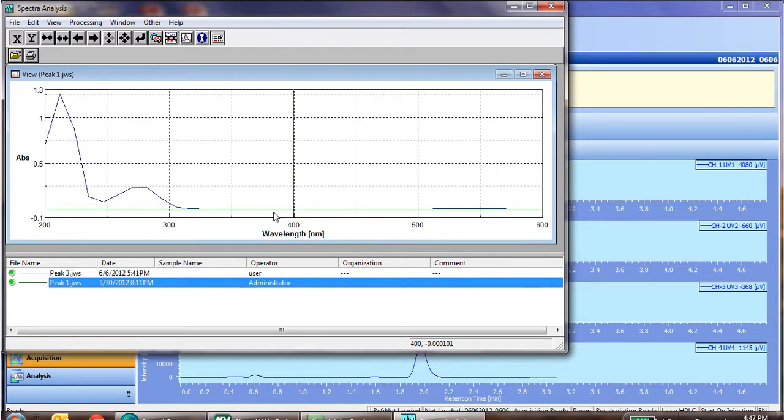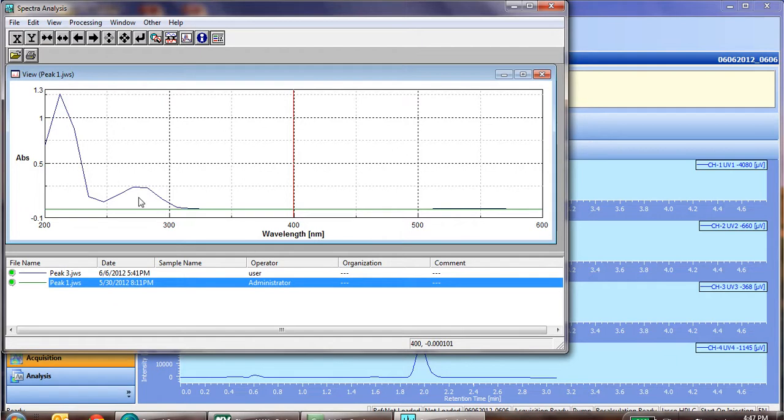Now in this example, the one named peak one was actually just some baseline, and as you can see, we see some significant absorbance from our peak number three that eluded in the previous chromatogram.